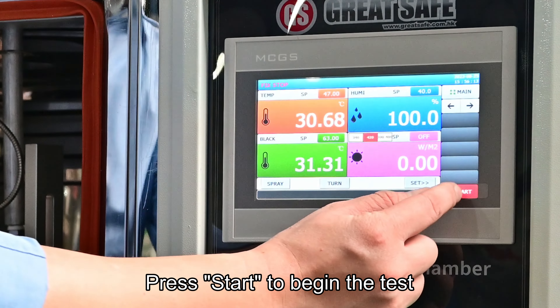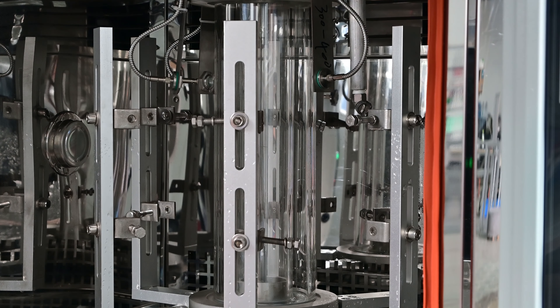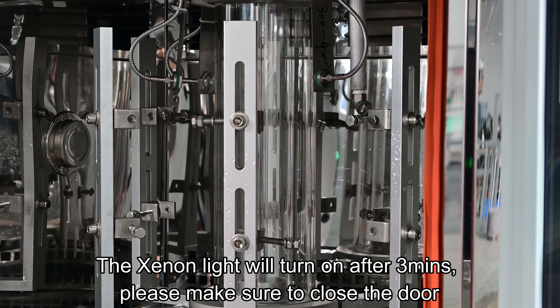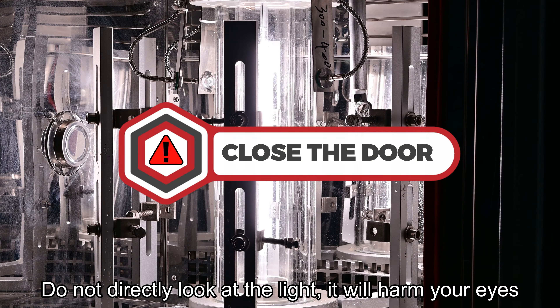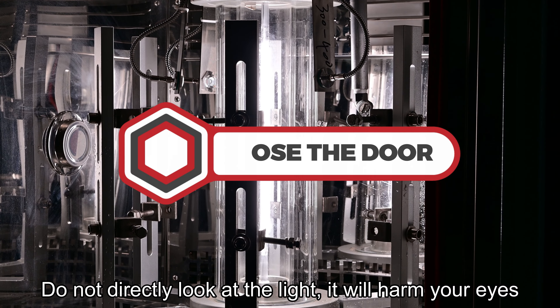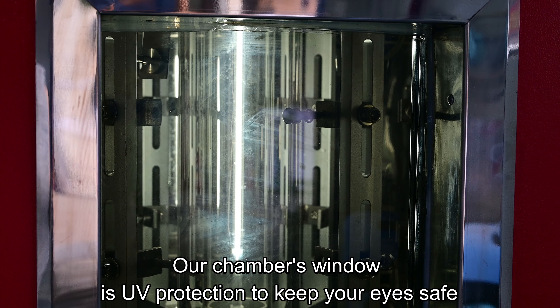You may now start the test. The Xenon light will turn on after 3 minutes. Please make sure to close the door. Do not directly look at the light — it will harm your eyes. Our chamber's window is UV protection to keep your eyes safe.